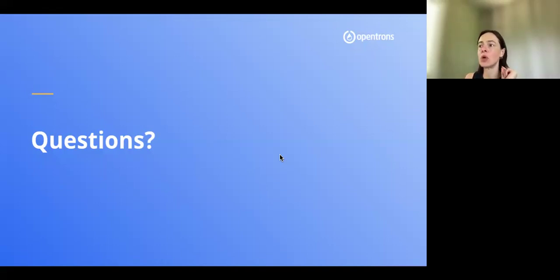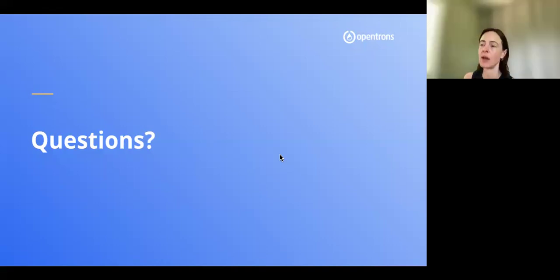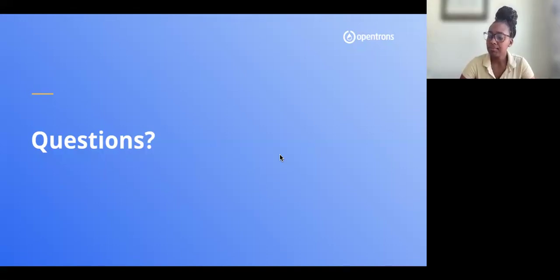The OT-2 is more adaptable to hybridization, right? So I guess this is hybrid capture. I think the question is, is the Flex or the OT-2 better for hybridization? Ricardo, if you have any clarifying comments, please type them in. But sure, that's the question.